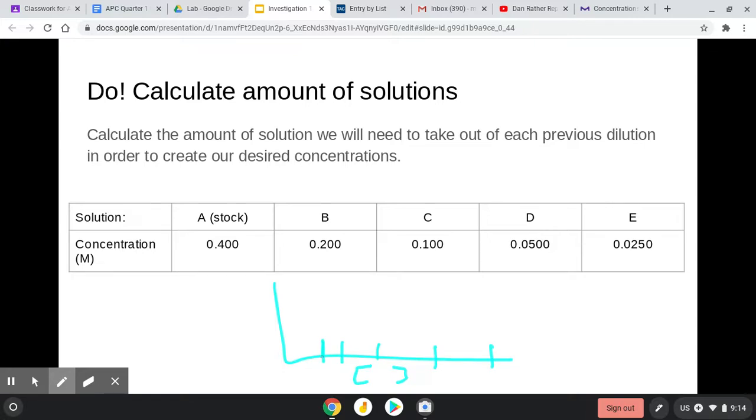And then we'll take the absorbance for all of these, and we'll get a relationship between concentration and absorbance. So then what we can do is take our unknown concentration, take an absorbance reading, go over to the graph, and then down to what the concentration is.